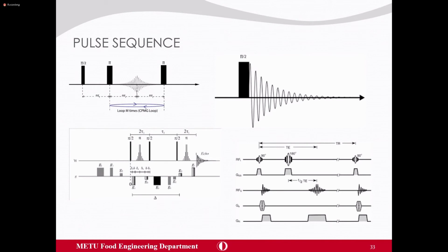We can have different types of pulse sequences, and we can apply additional terms to those pulse sequences, such as the gradients you might see in Dr. Morris' lecture, because usually to do imaging we will need these gradients.